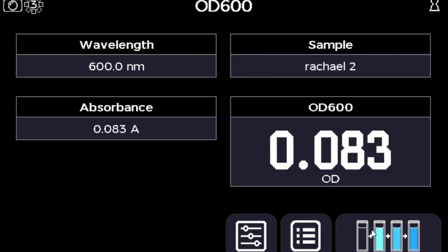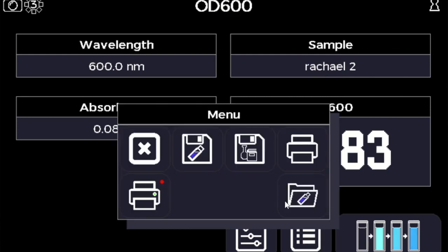When you press the sample read button in the bottom right-hand corner, it will very quickly go through and read your samples. You can then toggle between the results by clicking on the sample box at the top.